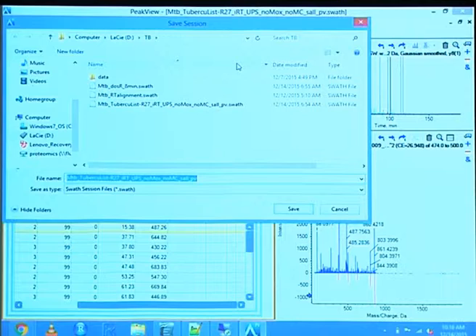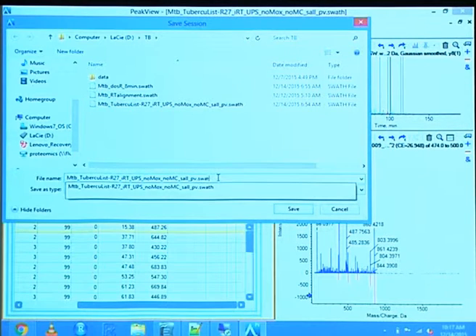So what I've been doing is specify which data you used and the settings. So the retention time window, how many transitions, and sometimes the mass accuracy, but I usually kept that constant. And we have to change the name. So the way it could look is that I'll give you an example.